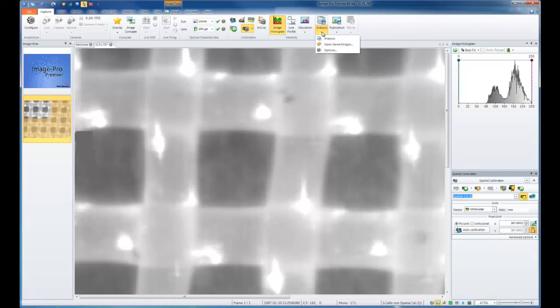Quick save for analysis will save all image data with no overlays burned in. Everything will be raw. Quick save for publication will burn in my annotations and my measurements and save it as a JPEG. If I have a movie file open, the movie file will save with my quick save as an AVI movie with everything burned in as well.